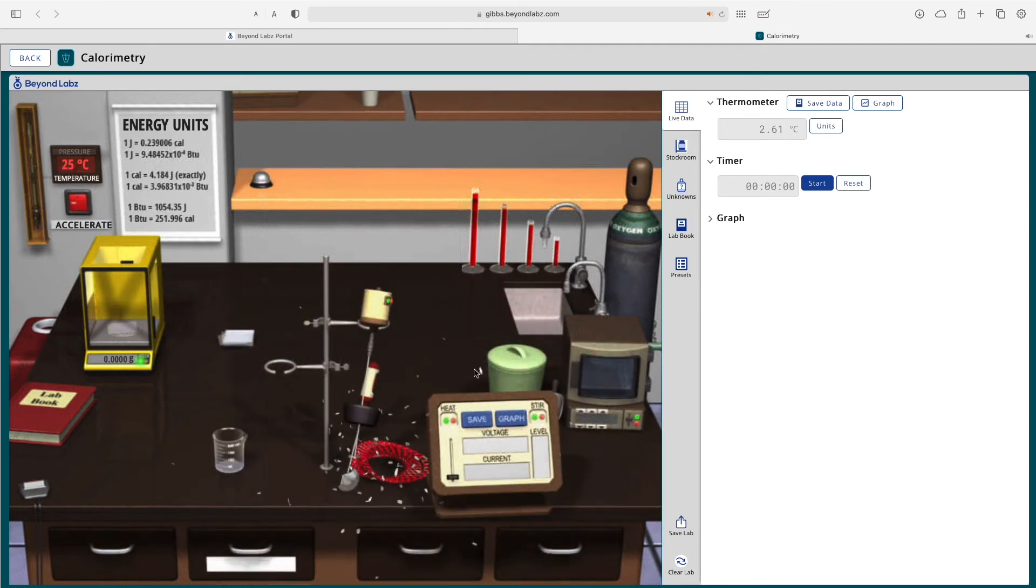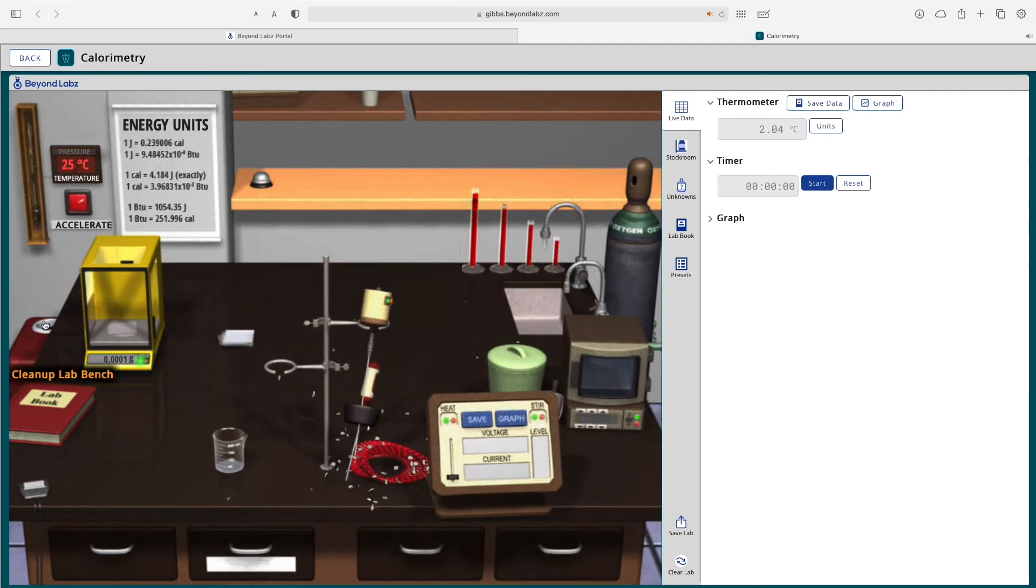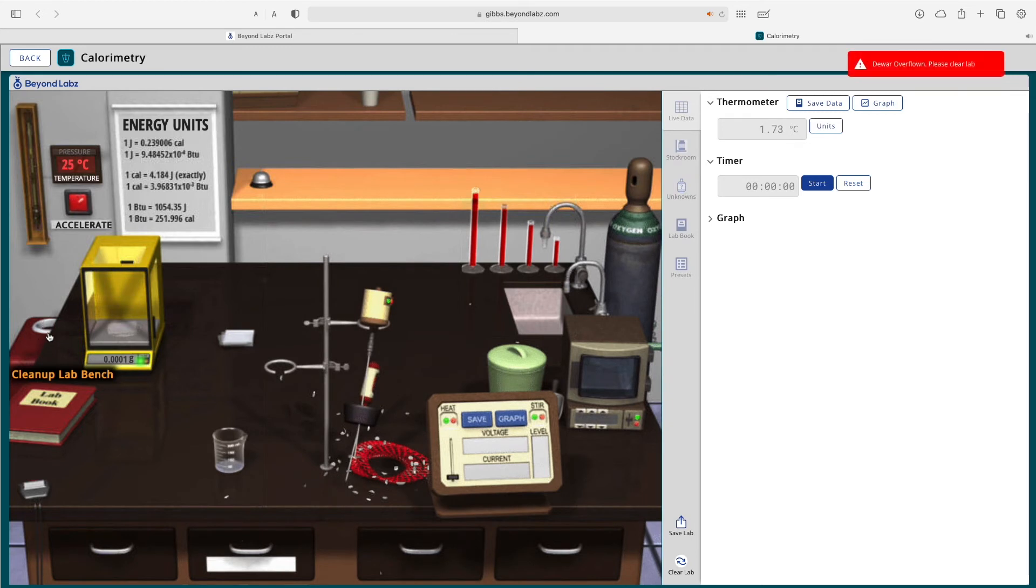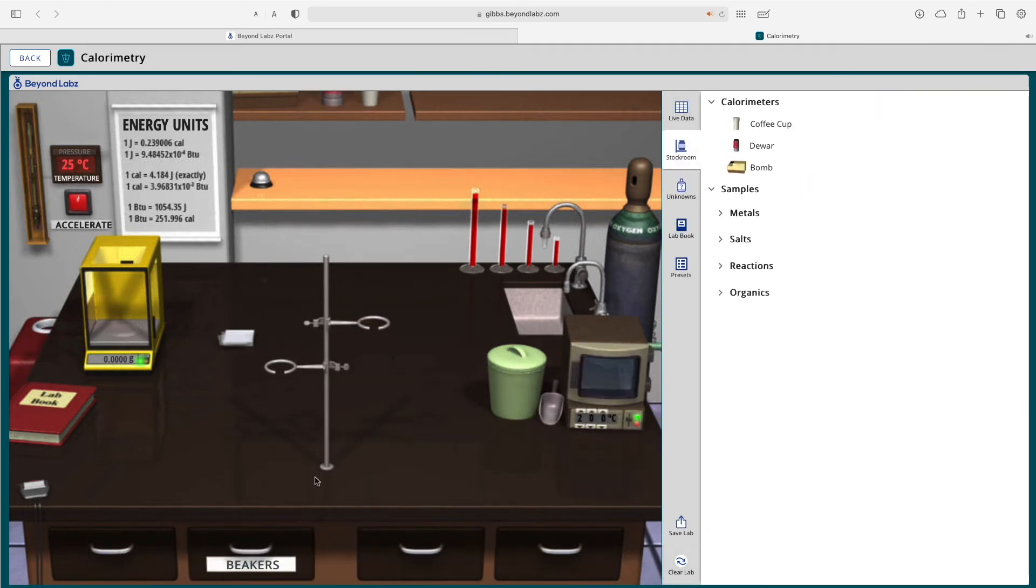You can see if you mix water and cesium, bad things happen. So if you need to clean up your lab bench, you can either click the red bucket here or clear the lab here.